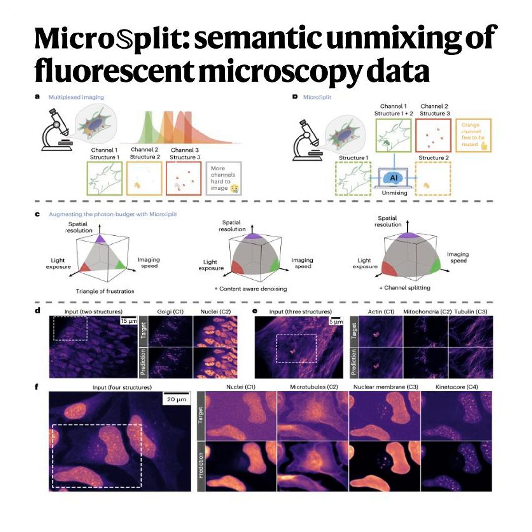Which changes the game entirely for live cell imaging. If your cell is moving, taking a stack of images means your subject has shifted between frame 1 and frame 4. A single image freezes that moment perfectly. And furthermore, the empirical comparisons in the paper show that MicroSplit vastly outperforms Picasso when the data is highly noisy. Because of that 90% weight on the denoising. Right. Picasso's math degrades much faster under high noise conditions than MicroSplit's architecture.